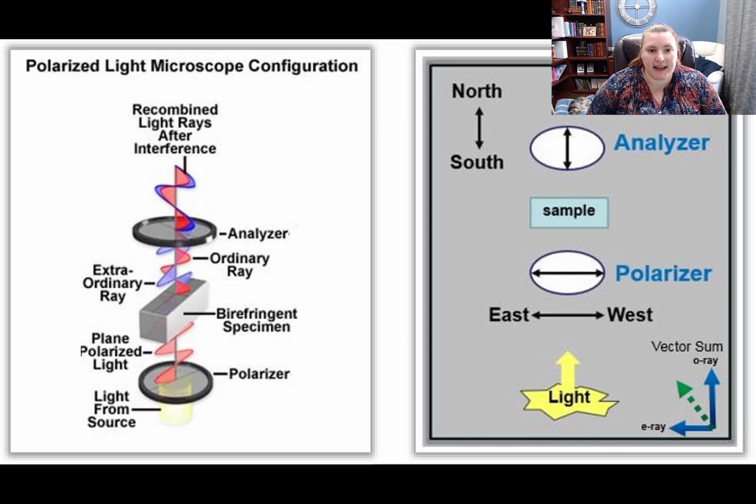Depending on the specifications of the polarization, the light can become partially or totally polarized as it goes through the sample. This level of polarization, as well as the characteristics related to reflection, absorption, and propagation, can help analysts determine what type of sample they're dealing with without having to destroy or damage the original piece of evidence.